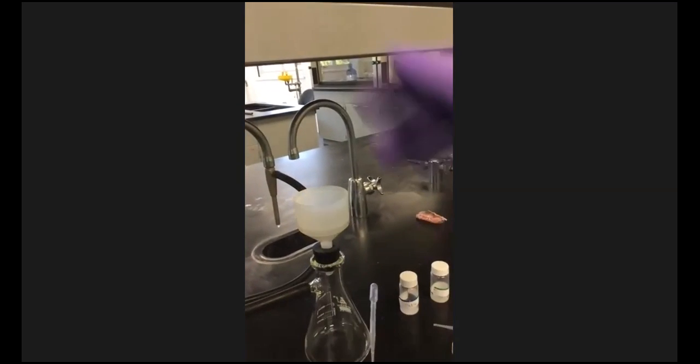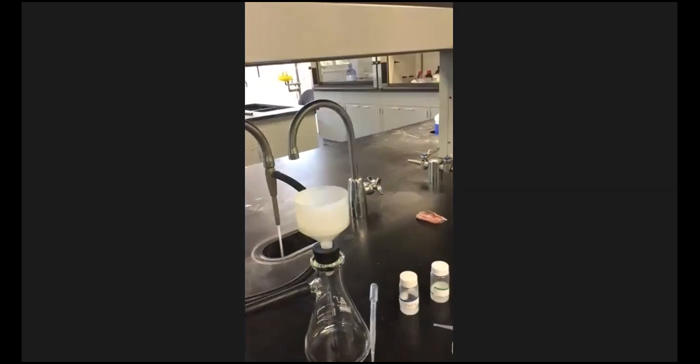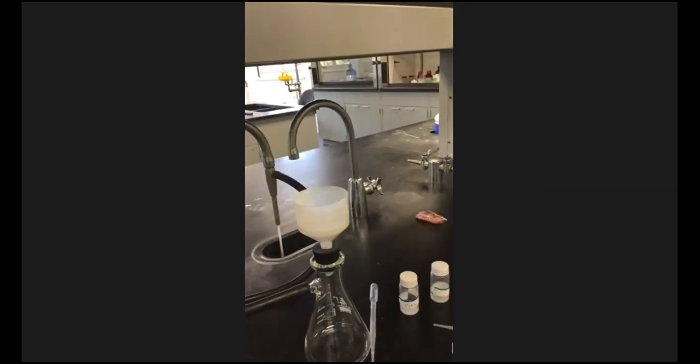All right. So now I just want to filter this. So let me move all of this stuff out of the way. And we're just going to turn on the water. And filter. And that is a lot.